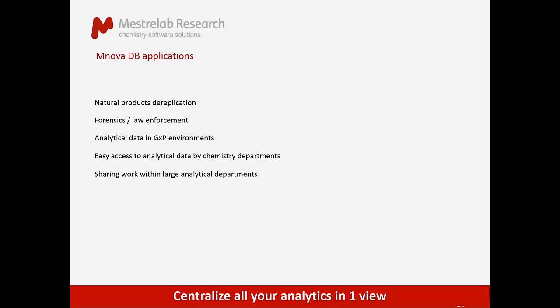So a lot of universities and companies use the database to set up the data, so that the chemists don't have to go and run around the browser looking in instrument folders and spending a lot of time doing that when a lot of data is being acquired, but can, for example, enter a sample number and just retrieve their data directly.